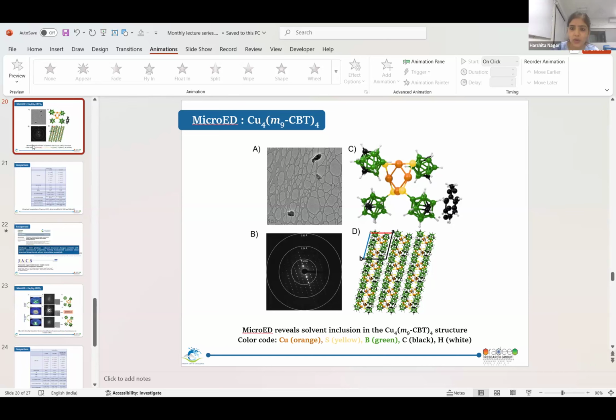The crystals which I got were crystallized in a DCM-toluene mixture. We have also crystallized it in toluene, and Arijit has the data with the toluene in the structure from single crystal X-ray diffraction. That's what Deepak was saying. We have this toluene, and I don't remember exactly, there was one more solvent present. We have some 5 to 7 structures. His point is valid that the same crystal could have been checked with single crystal XRD. Squeezing is normal; we squeeze all the solvents because we are not interested much in the solvent. Yeah, got it.